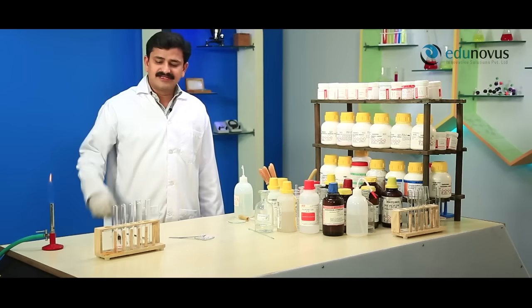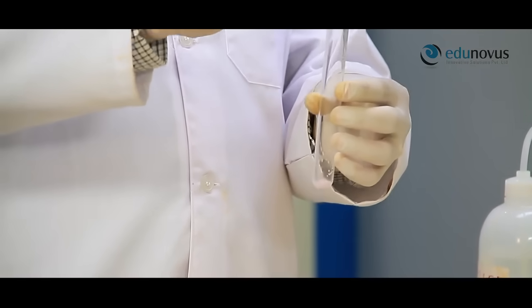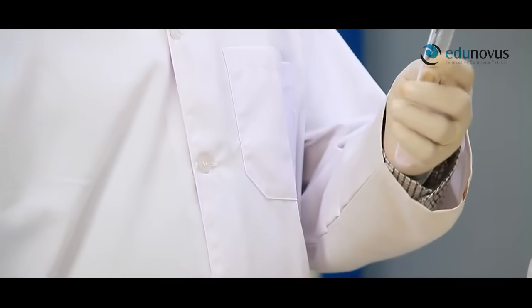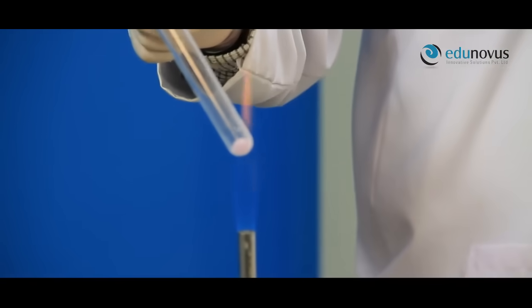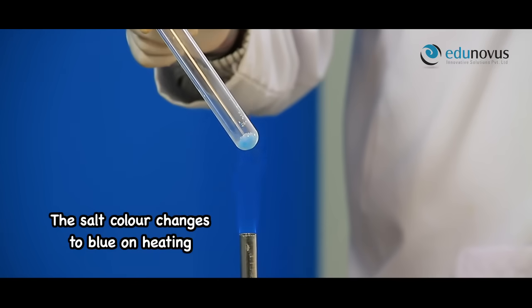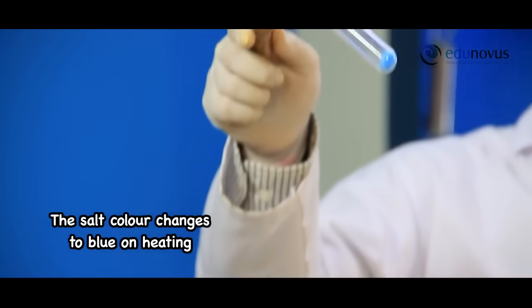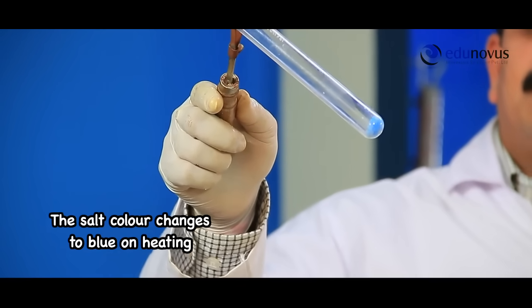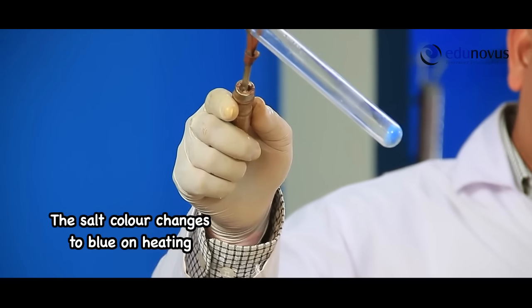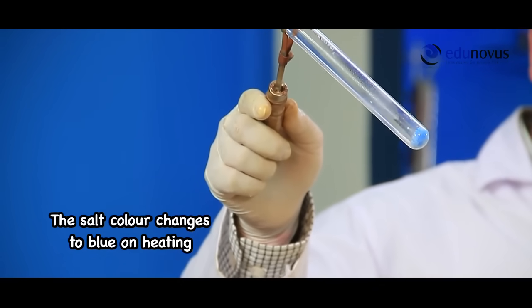Take a small amount of given salt in a clean and dry test tube and heat it using Bunsen flame. Here you can clearly see the change in color of the salt to blue. In this way, if the salt is blue when hot and pink when cold, it infers that the given salt may contain cobalt cation.